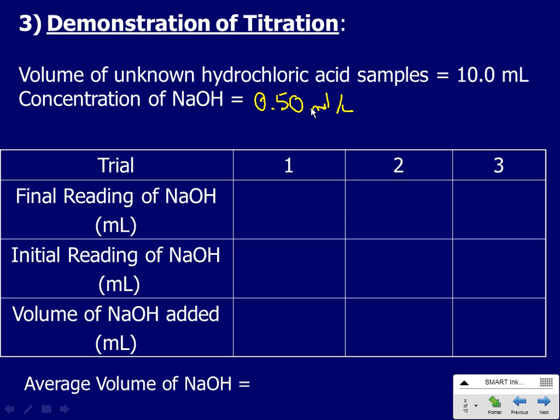We don't need a funnel. All we have to do is very carefully put that lip of the beaker right into the opening, and the liquid will stick to the glass and travel down. And I'm keeping an eye on the top, and I can see the level rising. I don't need to get too worried about it. And I'm actually going to load it way past the 0 mark, right? So I've loaded it quite a bit past the 0.